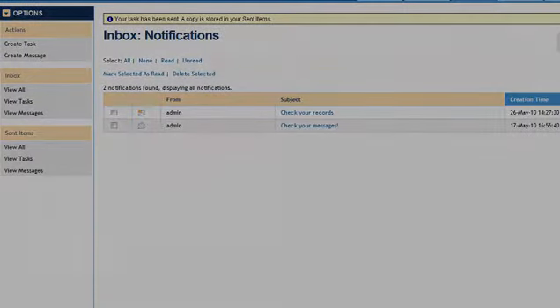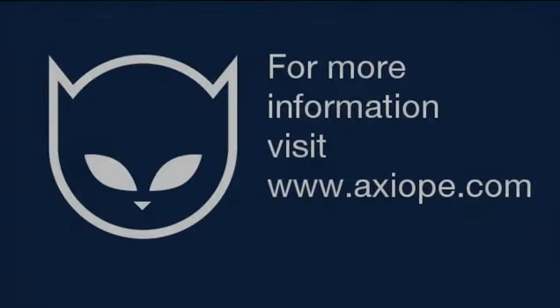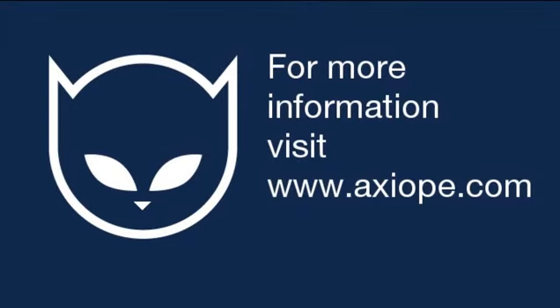In summary, with eCAT you get all the advantages of an online collaborative tool like Google Docs and the ability for everyone in the lab to bring their lab books online in a single, integrated, collaborative environment.